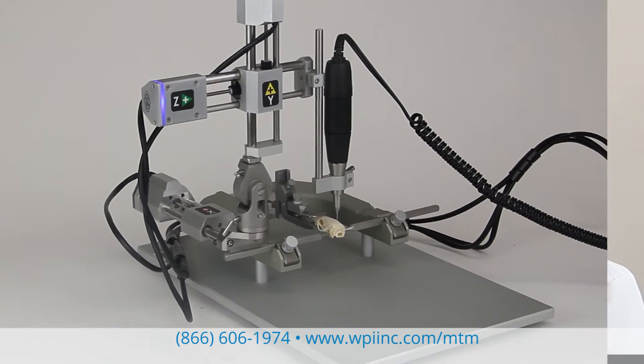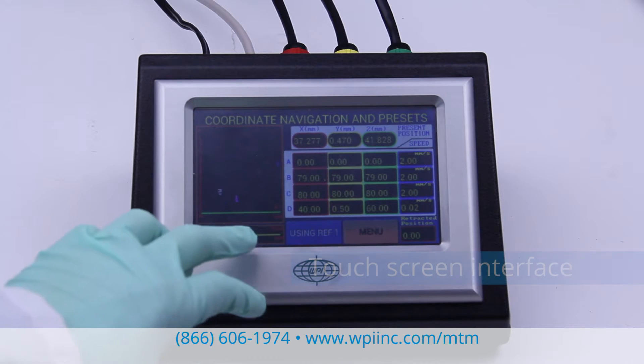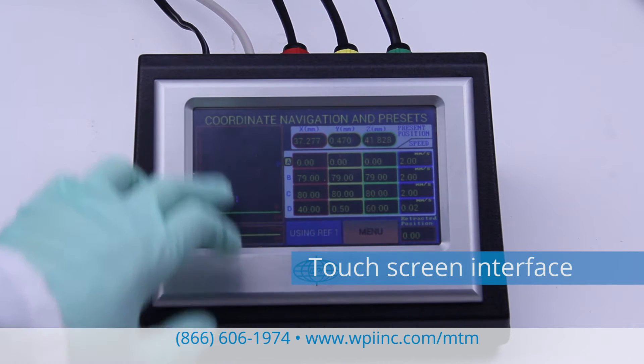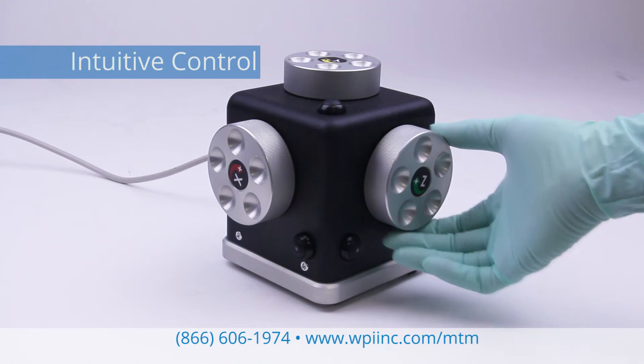Hi, I'm Lisa with WPI, where we are instrumenting scientific ideas. Today I'd like to show you our new motorized stereotaxic frame. It's easy to use with the touchscreen interface, or you can use the hand controller for intuitive and tactile control of the manipulators.